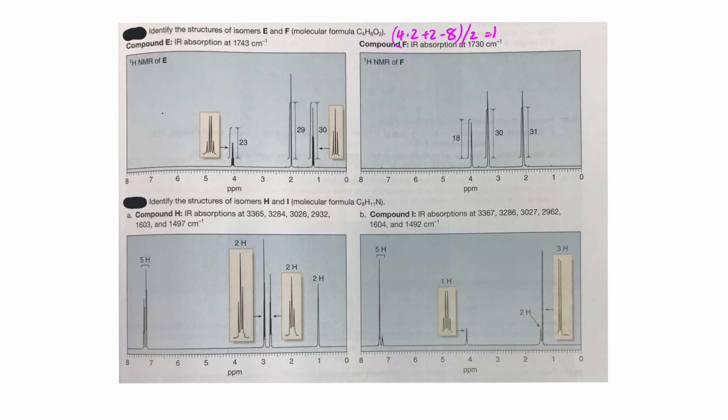I'm going to just draw a carbonyl up here to remind myself that we do have a carbonyl. And then we're going to look at the 3 signals in the proton NMR. You'll see that these 3 signals do not have integrations that look like 1 hydrogen or 2 hydrogens or 3. They're simply some numbers that the computer measures, essentially the height of this curve. This is the curve that we use calculus to derive, and that is showing us the value of the area under the peaks. You can see how these peaks have some area to them. It's actually rather slight, but they do have area. We measure that area, and that's where we get the integrations from.